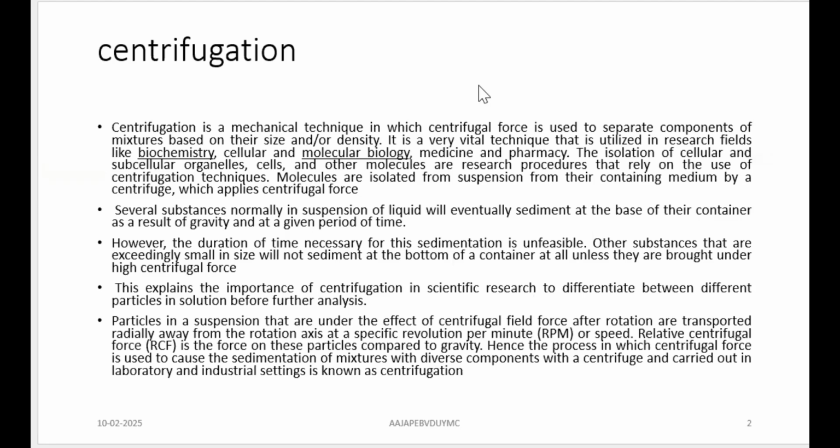Now, when it comes to the fields of application, biochemistry, cellular and molecular biology, medicine, pharmacy, chemistry, everywhere you need applications of the centrifuge, and you have different types of centrifuges which work based on what kind of centrifugal force they can generate and what speed they can attain. One type of centrifuge is just meant for separation of particles, or preparation of a particular fragment of the cell, or a particular type of macromolecule from the rest of the cell suspension or cell lysate, and so on and so forth, right? For separation you can use it.